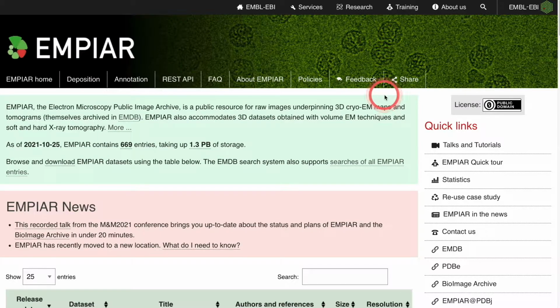Hello and welcome. In this video I'm going to cover searching the EMPIAR archive. Here we're starting on the EMPIAR homepage.